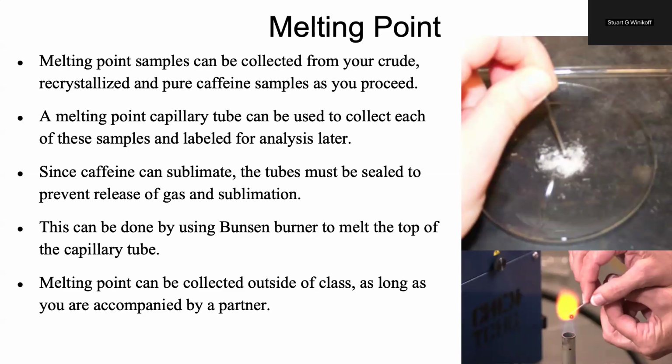But we are going to require that you come in with a partner. It could be a partner from class or a friend from outside of class. The major thing is we want to make sure that you're not working in the lab alone, as this can become a safety hazard. Even if you're not playing with any chemicals, all it takes is for somebody to have left, say, some dichloromethane out, and you start to feel a little bit lightheaded.